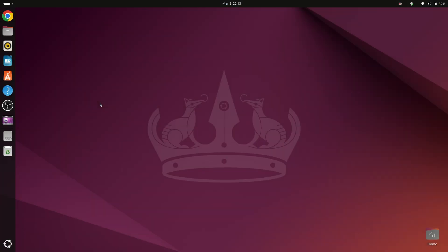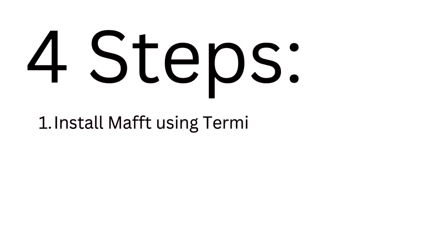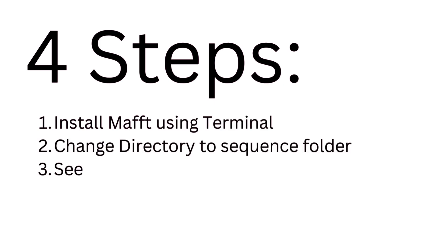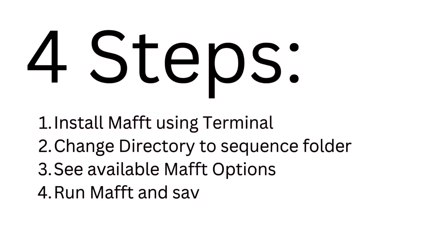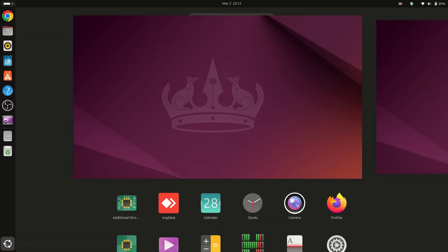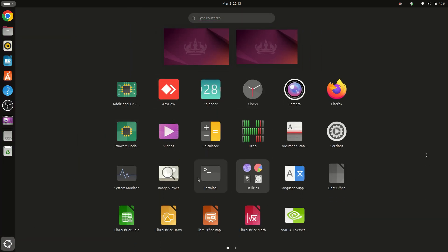In this tutorial we will see how to perform multiple sequence alignment using MAFFT. So first we have to open our terminal.